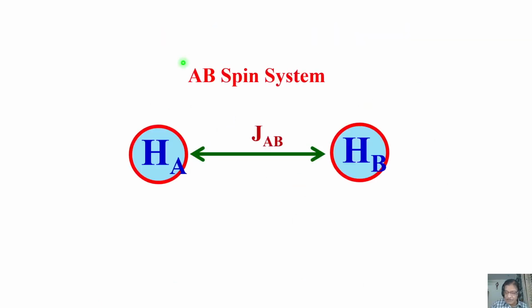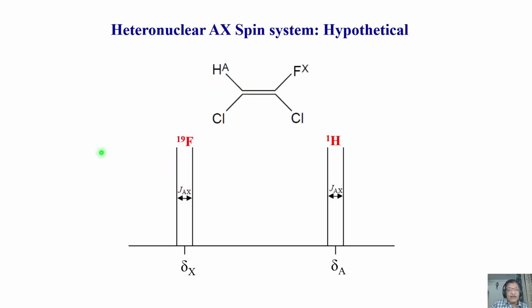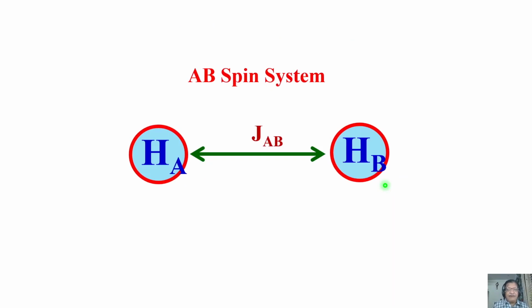Okay. And you also notice here, because it is a perfectly weakly coupled spin system, the intensities are exactly equal, 1:1:1:1. This is what I was telling you. We should see this in the realistic homonuclear example. You are not getting that. You are getting the roof effect. That should not come. So now this is a real perfect example of a weakly coupled AX spin system. Now we'll go a little bit further. I will look at the two-spin strongly coupled case.